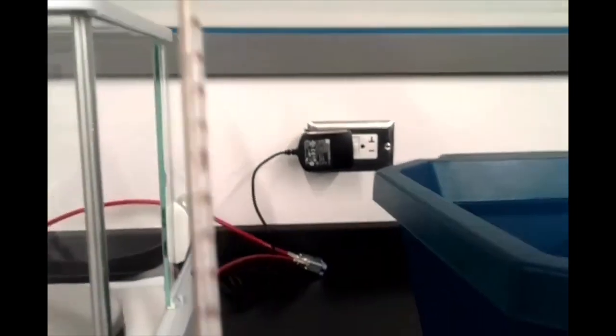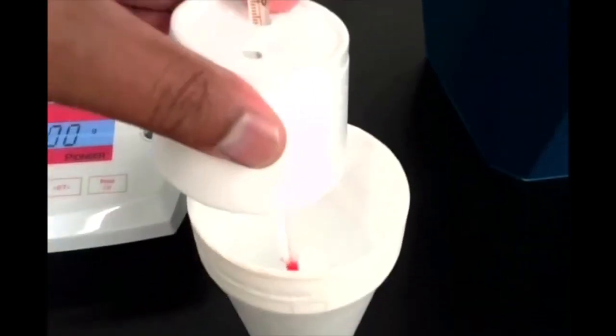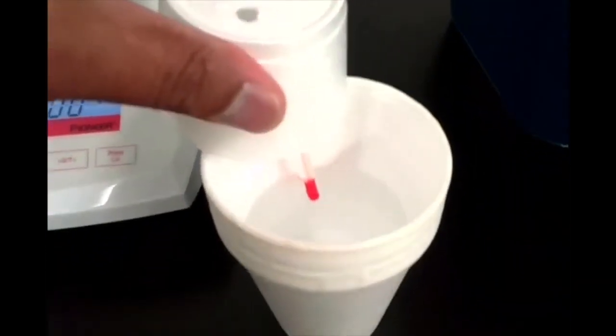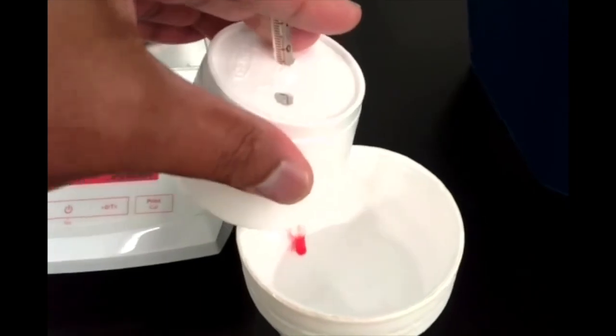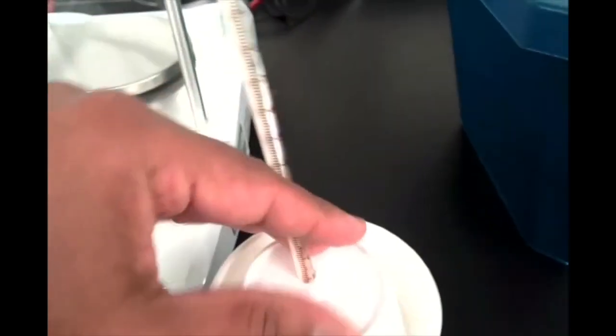Alrighty, we're getting to about the temperature we want, so as soon as we know that our ice is all melted, looks like there's still a cube in there. I guess it's hard for you guys to see with me angling that webcam wrong. There we go, hopefully. Yeah, it's a little hard to see in here because it's a little dim inside the styrofoam cup, and the ice cubes as they get thinner and smaller, they get a little bit translucent, so it's hard to see. But right now I can't hear any clinking from the thermometer, so I think that should mean that all the ice is melted.